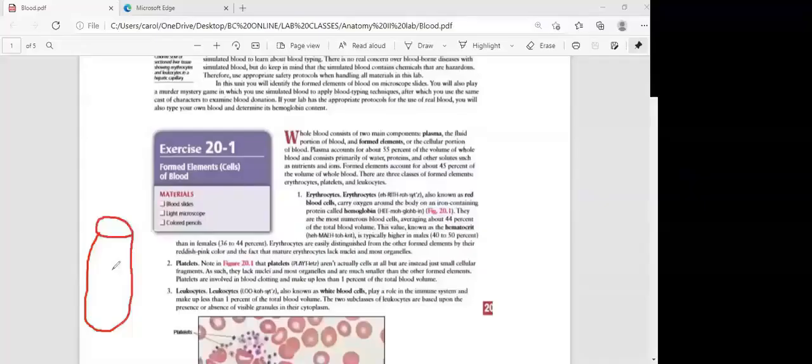So the centrifuge is going to spin at high speeds, and that's going to force the red blood cells to drop to the bottom. So the red blood cells that you have in your blood will go right here at the bottom of the test tube when you centrifuge that. Now, the top part is going to be the liquid that we have in the blood. Since the red blood cells were in that particular fluid, and then after you put it in the machine, these red blood cells went to the bottom, for that reason, your blood is considered a suspension. Why is it considered a suspension? Because your red blood cells are suspended in this fluid.